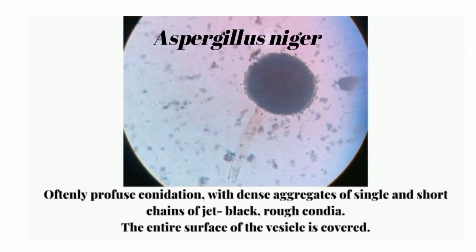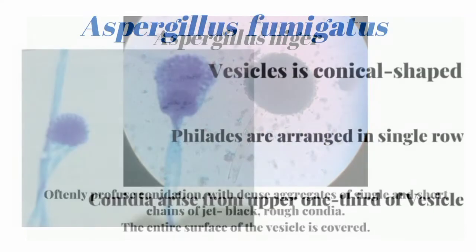Next one is Aspergillus niger. Microscopically, the vesicle is globular shaped. Phialides are in two rows. Conidia arise from the entire vesicle, and the conidia are black in color.